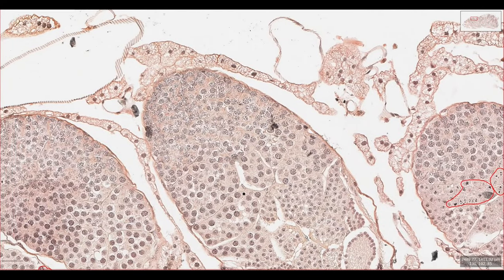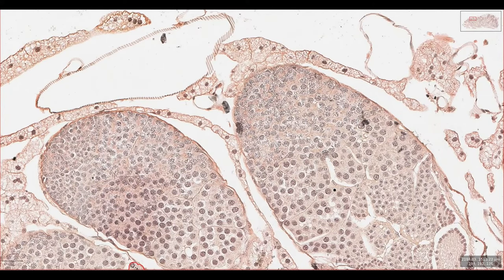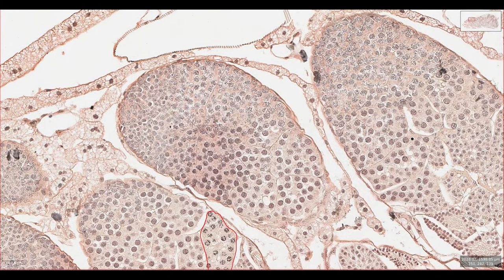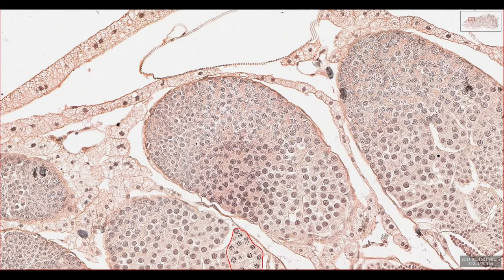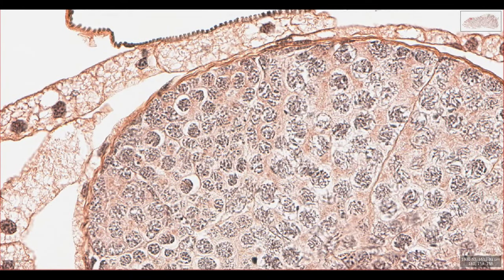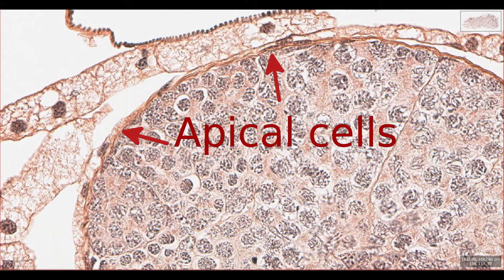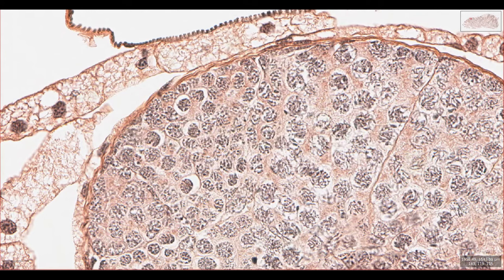The germarium contains germ cells. This is a generic name for cells in any animal that give rise to the gametes — in this case spermatocytes rather than oocytes or eggs. As well as germ cells, the tip of the testis follicle is lined by large apical cells, these ones here. These apical cells provide nutrients to the germ cells via cytoplasmic extensions. The germarium is probably the first layer of cells lining the tip of the testis follicle.